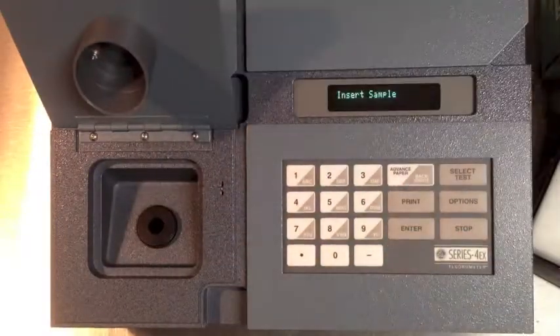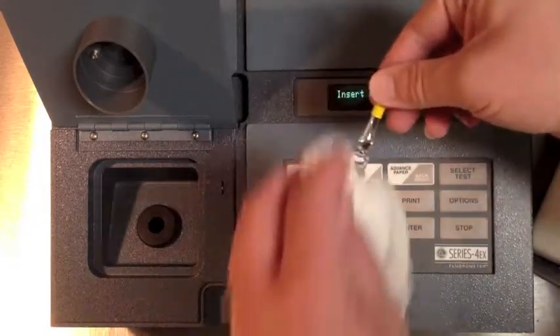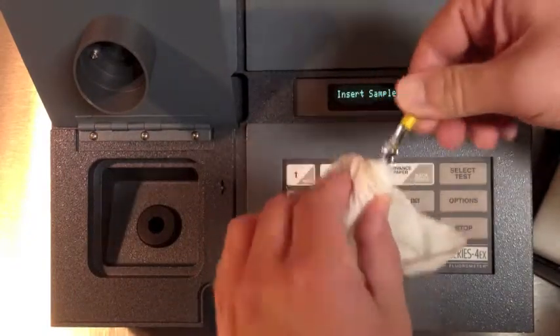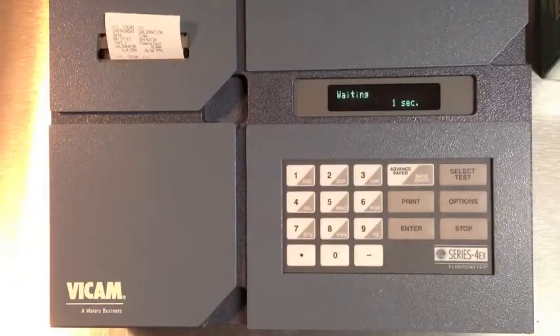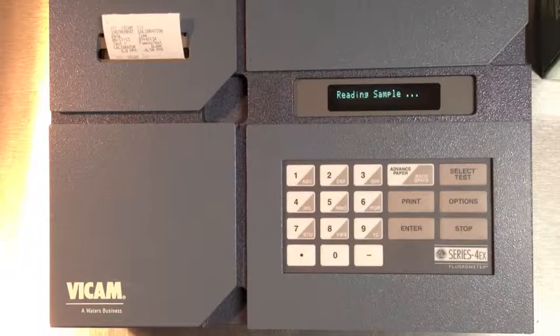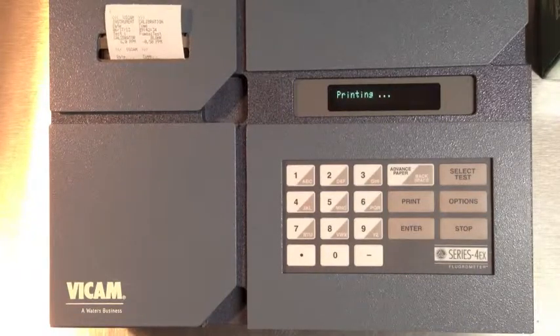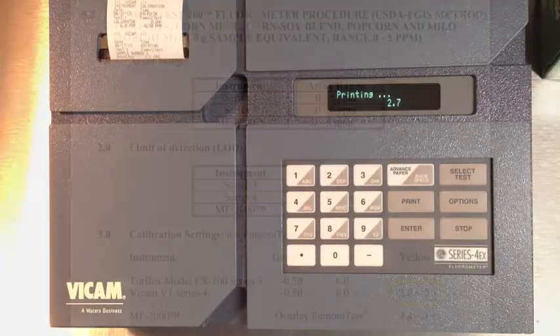Then insert the yellow vial. Your results should fall into the range found in the current procedures manual.